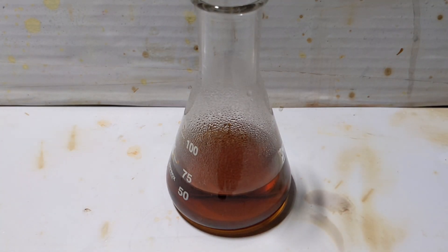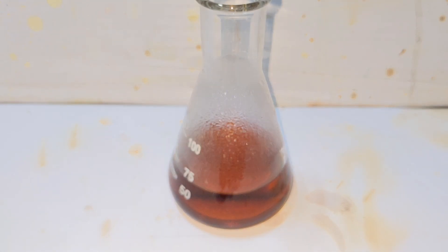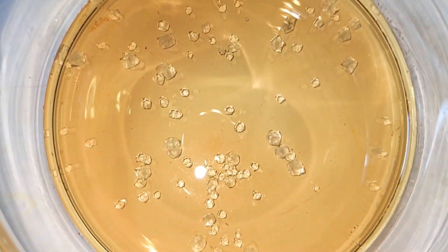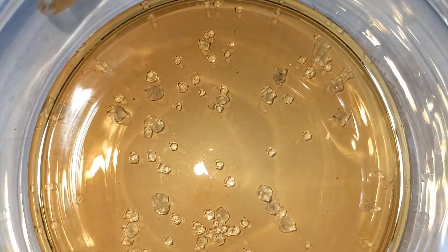Then I gently heated the solution and removed around 10 to 20 milliliters of water. I then poured everything into a crystallizing dish and allowed it to cool down undisturbed for a few days. After two to three days, crystal formation was evident, with most of them in an octahedral pattern resembling the crystalline lattice of ferric alum in theory.